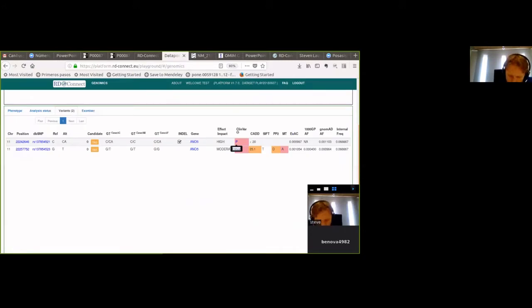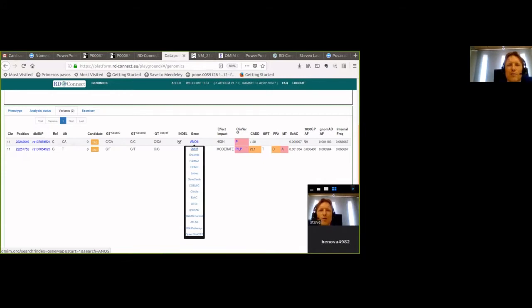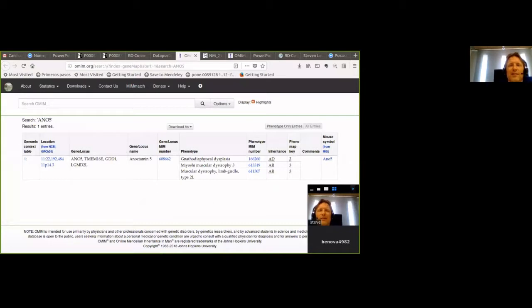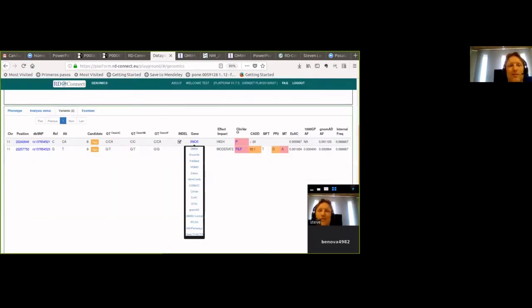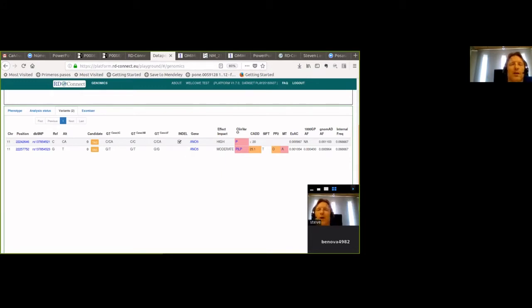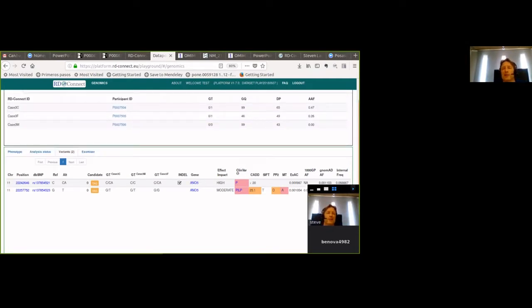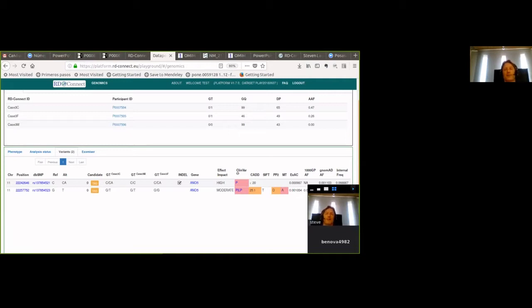From here we can link directly out to ClinVar and see the description of the gene, the disease, and all the reports. Going to OMIM for ANO5, we can see it's involved in several muscular dystrophies — particularly muscular dystrophy limb-girdle type 2 and Miyoshi muscular dystrophy — with an autosomal recessive inheritance pattern. This is a very good candidate to explain the phenotype of our individual. However, this is only an in silico diagnosis — you always have to go back and confirm the variants are real, through Sanger sequencing or RNA-seq as appropriate.